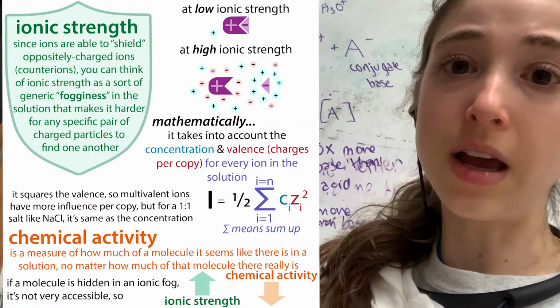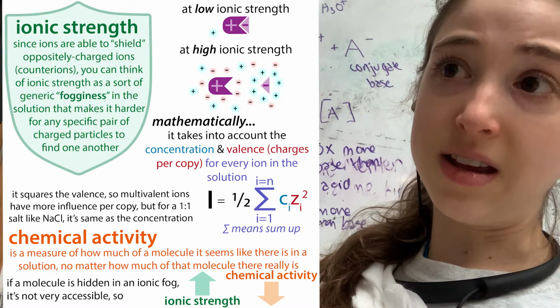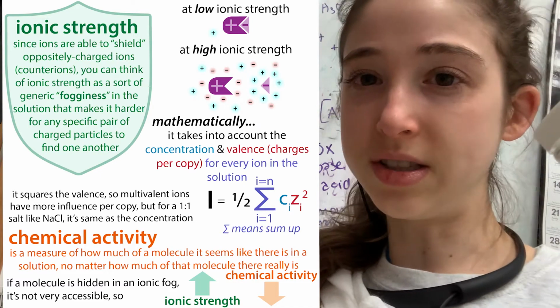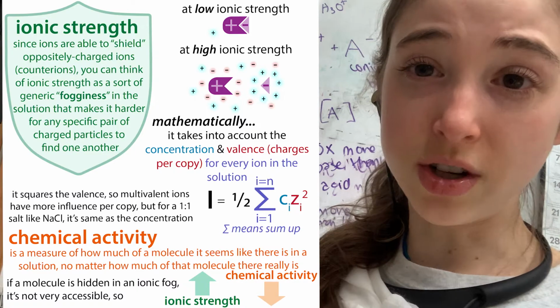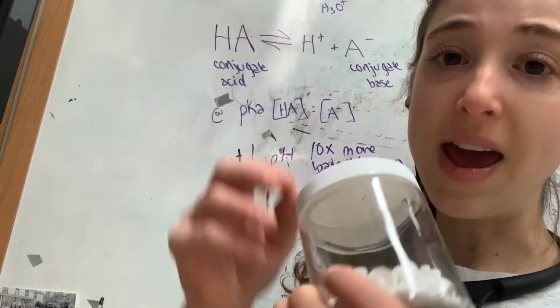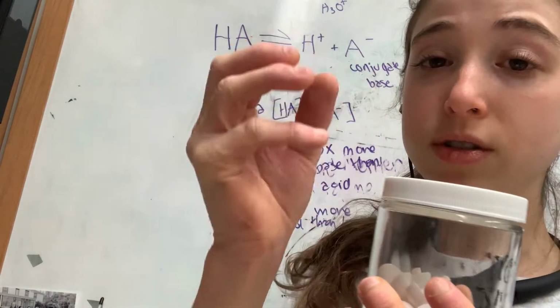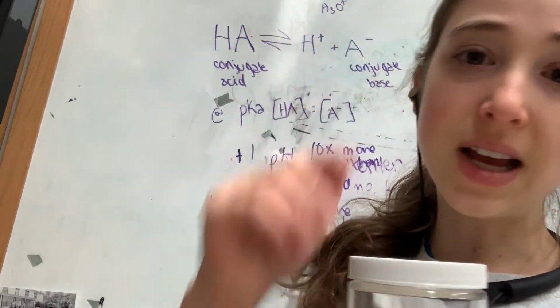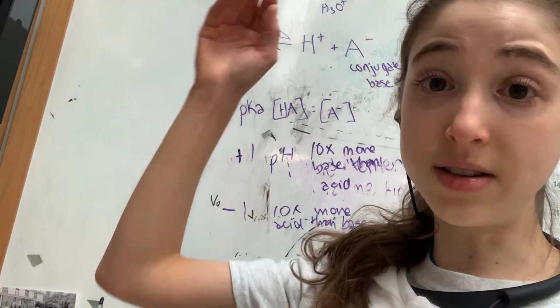You don't want to be super increasing your ionic strength, because it makes a kind of molecular fog, where it's hiding the charges and making it harder for charged molecules to see each other, because now you have all these external charges in there. That's why it's good to calculate ahead and prepare the concentrations that you're going to add in order to get close to your desired pH, and then you can make those slight adjustments without having to make major adjustments that are going to crazily salt up your solution.